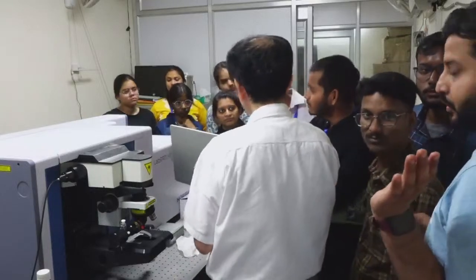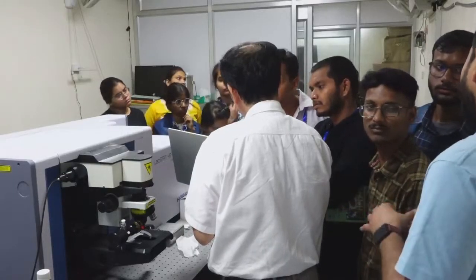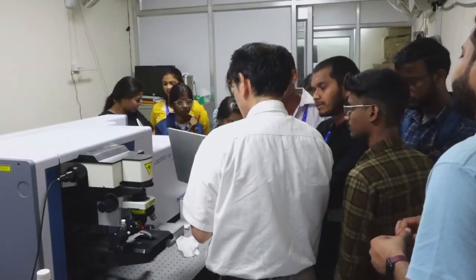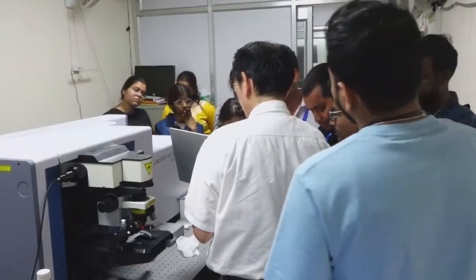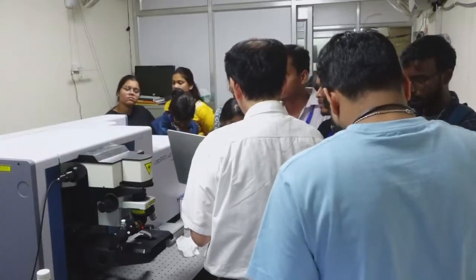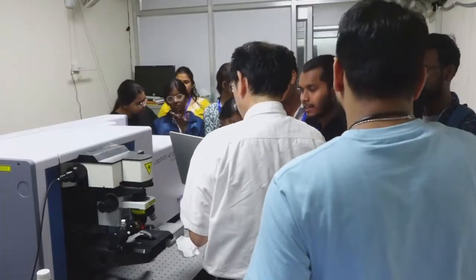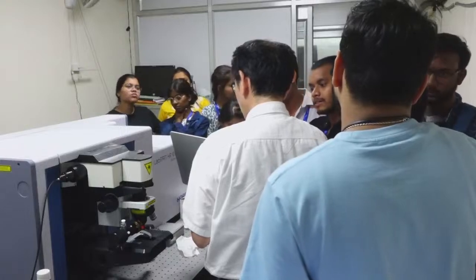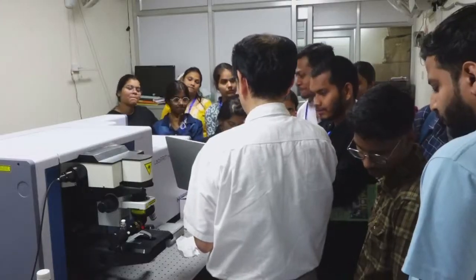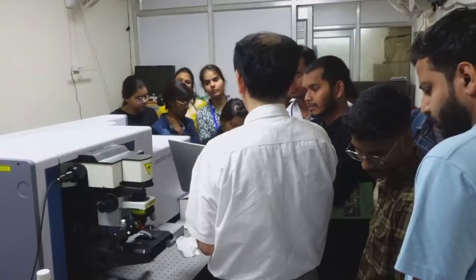What is the difference between elastic and inelastic scattering? Can we see what's inelastic scattering and what's elastic scattering? Inelastic scattering, like neutron scattering. Sir, can we observe elastic and inelastic scattering in the graph? I have no idea. Anyway, this is a scattered light spectrum, and the origin should be identified in a separate way.